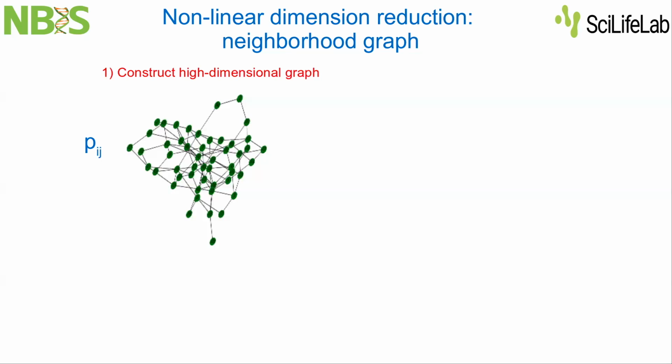They represent your original data in this strange graph form, where one node is one cell, and the edges are computed. They're basically correlations between your samples or cells computed through gene expression values.